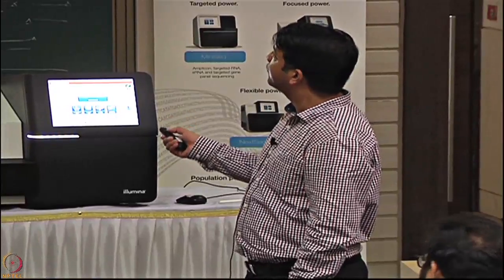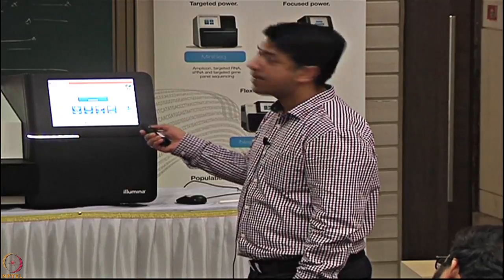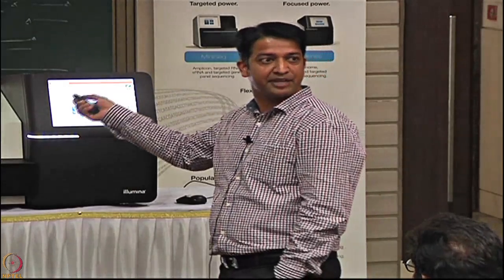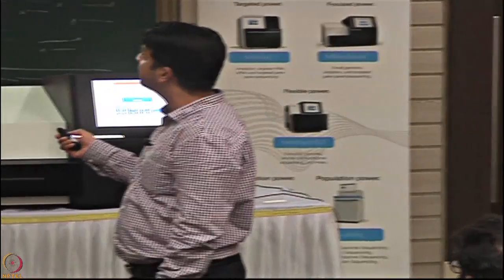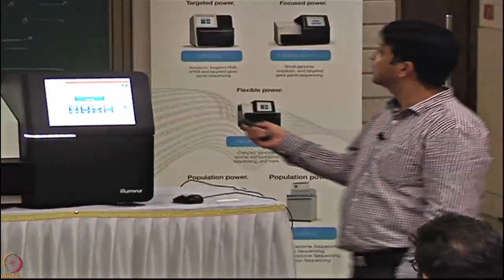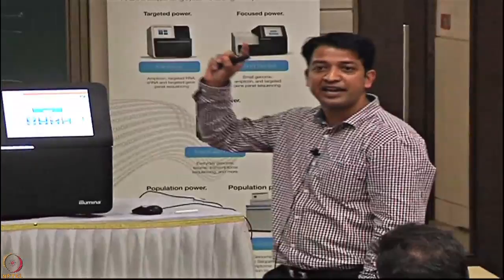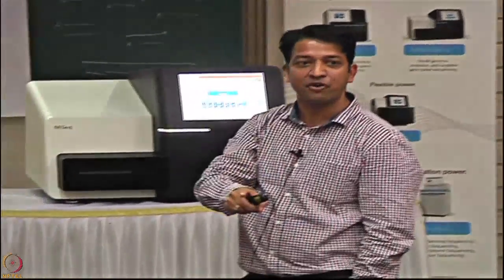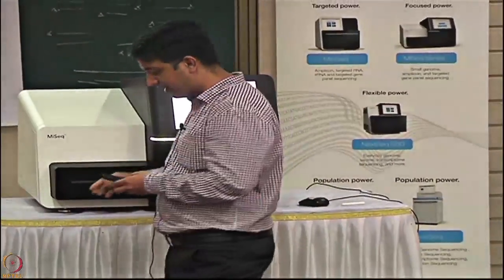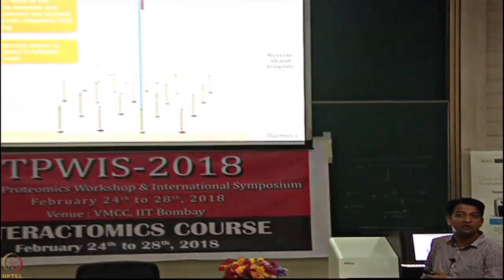What needs to be done is we will denature it. Again, we will deblock this end. Clear? Again, it will flip because we have deblocked the end. And again, you can see multiple clusters will be generated. But this time, we are going to cleave away the forward strand. Initially, we had cleaved away the reverse strand and gone for the sequencing. Okay, so we'll cleave away the original forward strand and this is how we are ready for sequencing the second read. So this time which primer will go and bind?